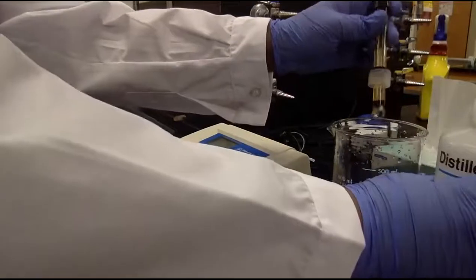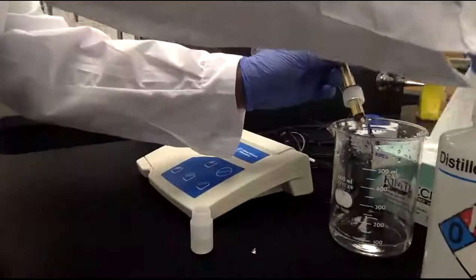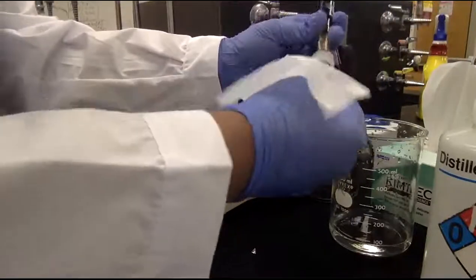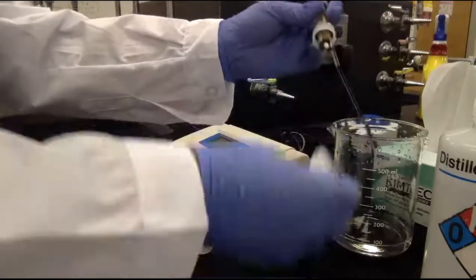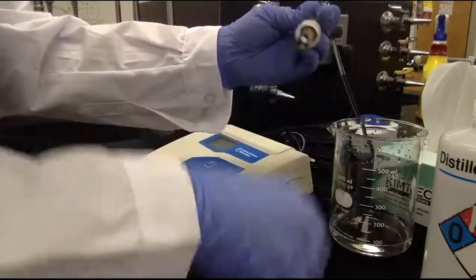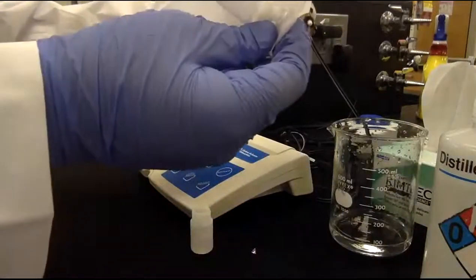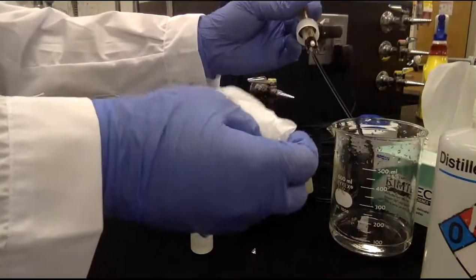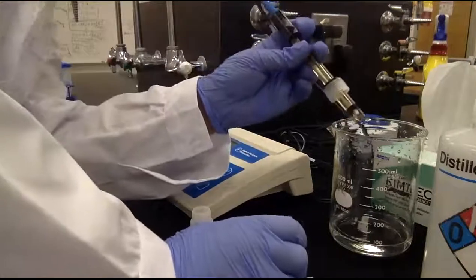Was it fine? You just wash it, wipe it with the clean wipe. So think about it. If you don't wipe it, there are still a couple drops of the water on it. And when you dip it into your buffer, you dilute your buffer. Wouldn't molecules of the wipe get attached here? That's why we use Kim Wipe, so it's fiber free. Oh, that's nice. A science brand, I see.